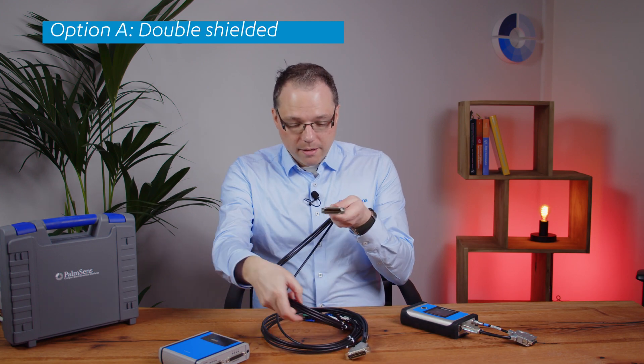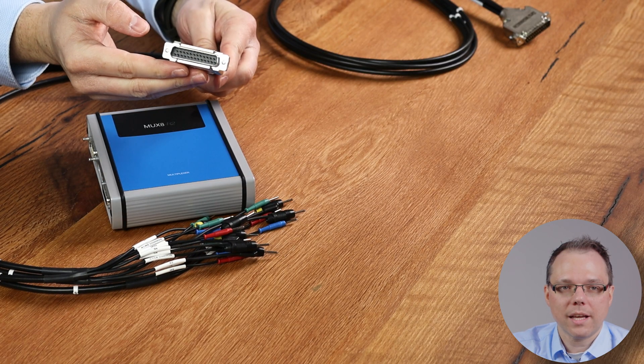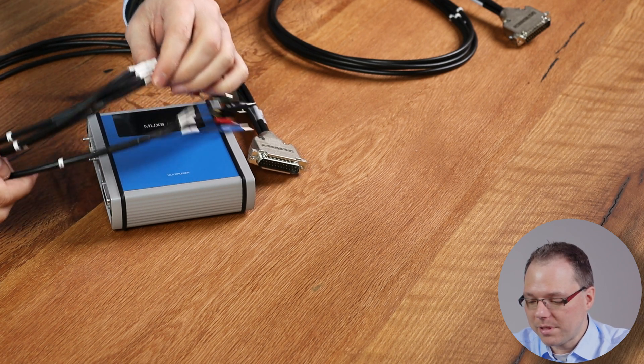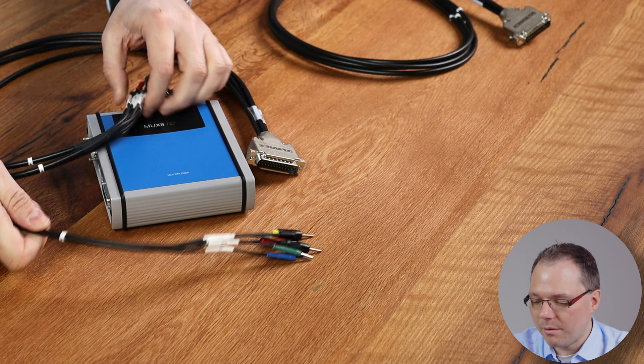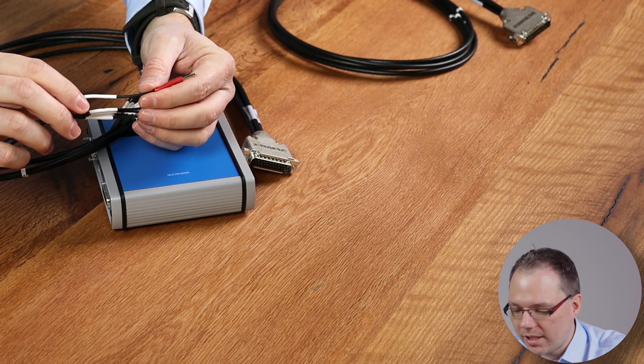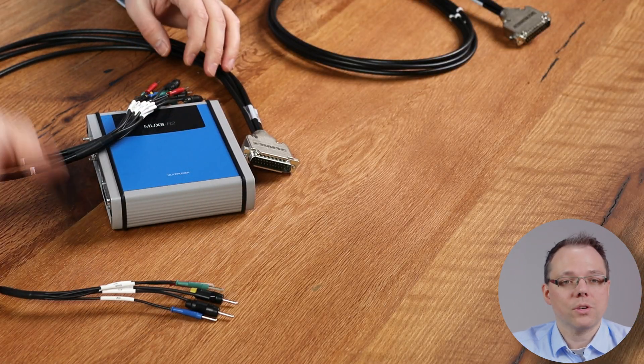That's one side of the connection, but there is more to connect because you also want to connect your multiplexer to your cell. We have different connection options, and I would start with the most popular one, which I consider the most versatile. These are our double shielded cables — basically the same cables that you use for our potentiostats, the ones that you get for the single channel potentiostats. On one side you have the connection for the multiplexer, and on the other side you have a set of two-millimeter banana plugs that are labeled as well. Each bundle is labeled with a channel number, and each single lead is also labeled with its function and channel number — for example, W3 for the working electrode of the third channel.